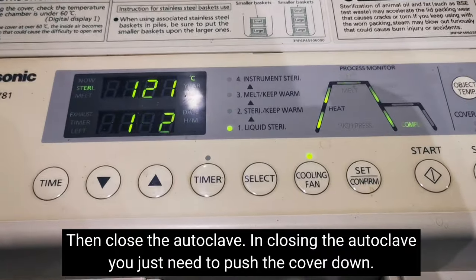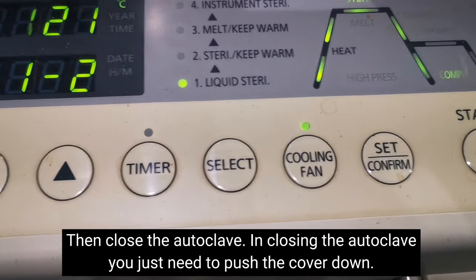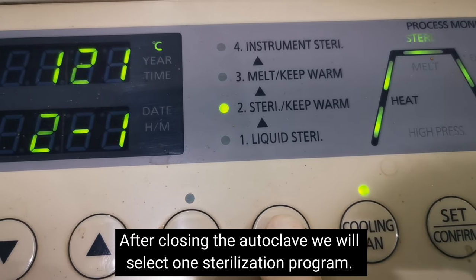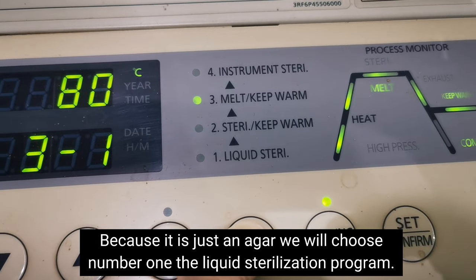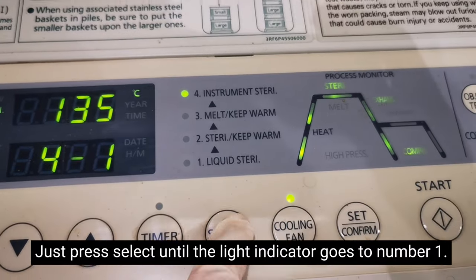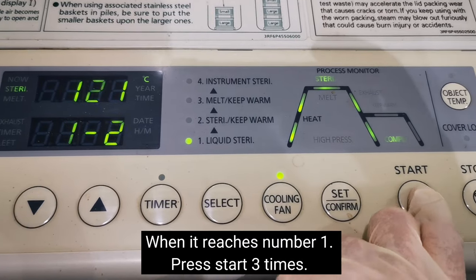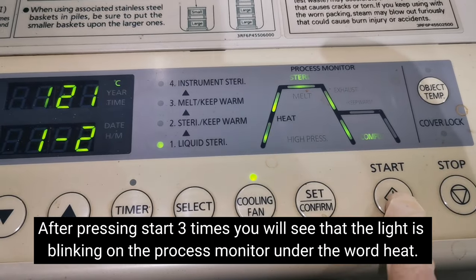Now close the autoclave — when closing, just close it; you don't need to press the handle. After closing, it's time to choose the sterilization method. We will use liquid sterilization because what we're autoclaving is liquid agar. Press 'Select' until you reach number 1, which is liquid sterilization. Now it's on number 1 — liquid sterilization.